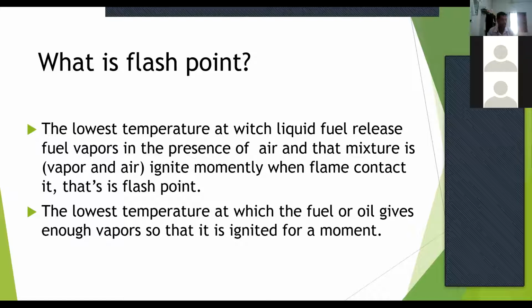If we consider a fuel sample, when we increase its temperature, fuel vapor will be produced, and it will mix with the air, forming an air-fuel mixture.